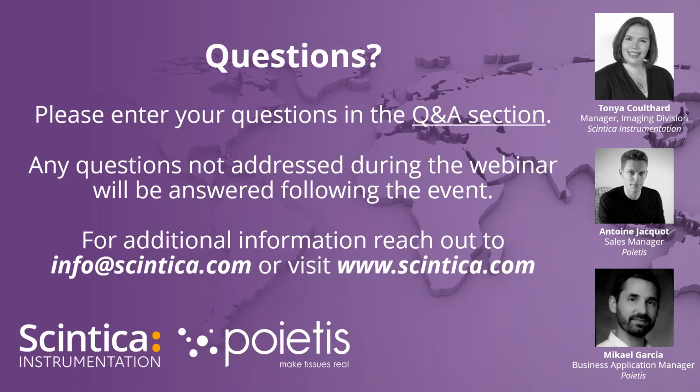There is NGB-R for research, and here everything is very much similar to another research biosafety cabinet. And there's NGB-C, which will target the clinical market, so for definitely clinical applications in which sterility is one of the most important factors. And so the cabinet for that second bioprinting platform will be different. It will be an entirely closed environment to preserve sterility to 100%. So I'm not sure whether that person was referring to NGB-R or NGB-C.